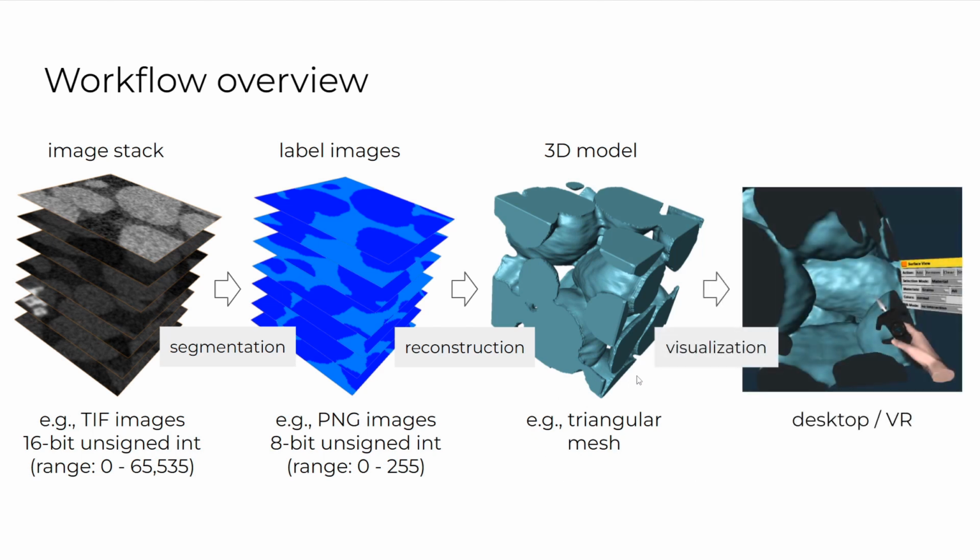Finally, we can then use the extracted 3D model for visualization and quantitative analysis, either on the desktop or in virtual reality. While for most applications, visualization on the desktop is sufficient, having the ability to visualize and interact with your data in VR can provide a unique perspective and experience. And the nice thing about our workflow is that you won't have to write a single line of code to bring your data to VR. So it's very easy, as you will see very soon.